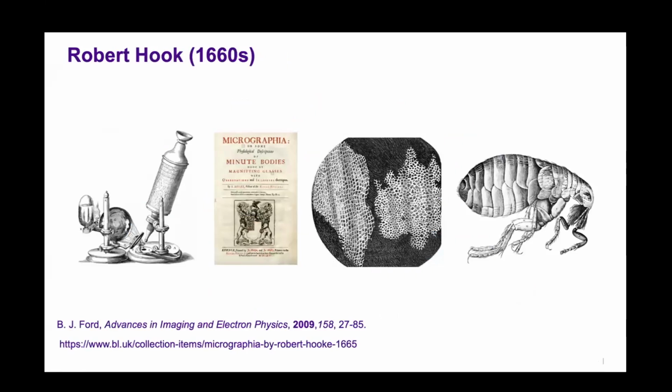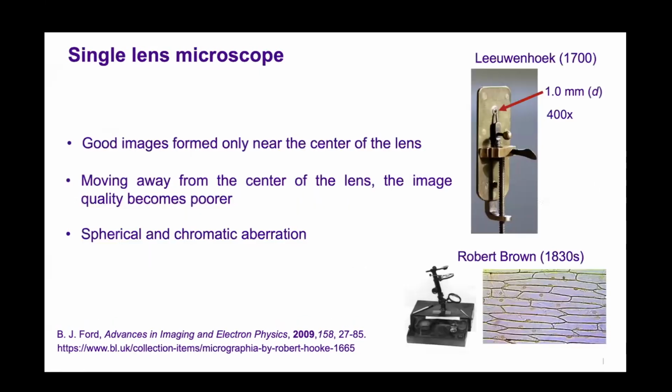So Robert Hooke had the compound microscope. It's very simple. You have the lens, an objective lens and an eyepiece. And there is a lamp, there is oil, and a water container that will focus the light onto this lens, and then you have the object here and you can visualize it. He used these cork cells, which he called cells. These are not really cells, just compartments.